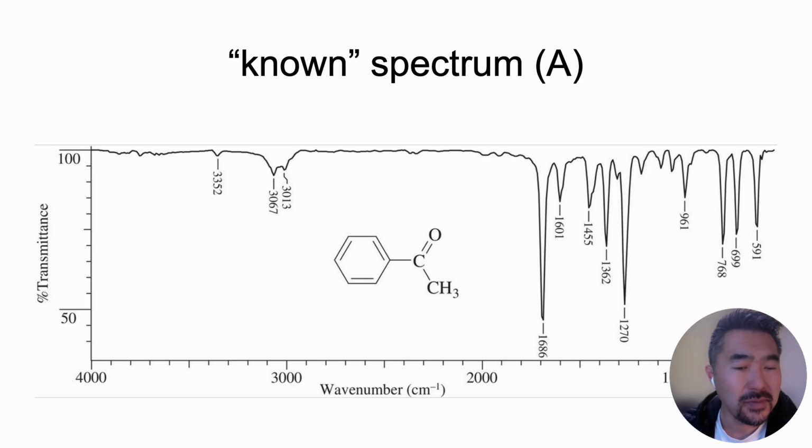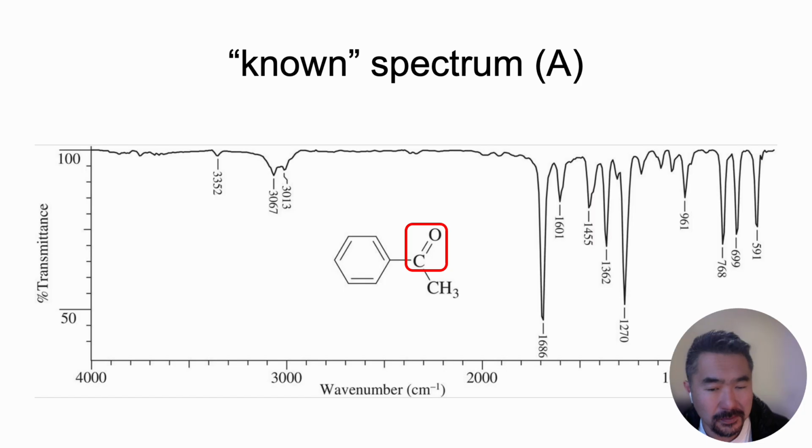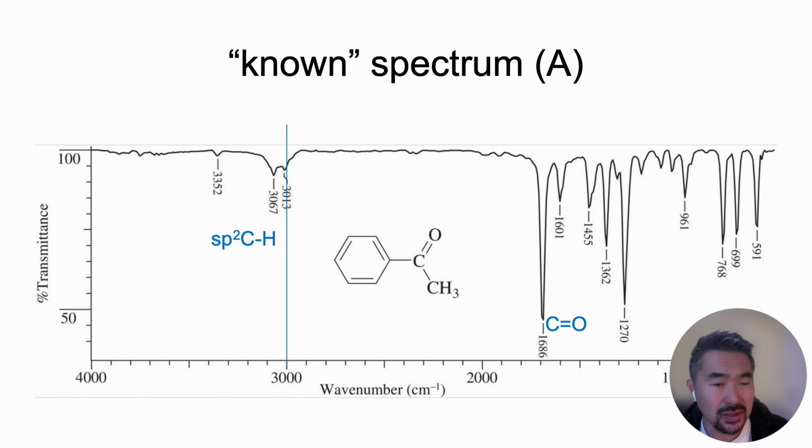Okay. Here's a compound actually known as acetophenone. It smells like a pistachio because this compound is actually present in pistachio. But here's the carbonyl, which shows up here again. It's lower than 1700 because of the conjugation. So we could identify that as carbonyl. And we should see sp2 alkene-type CH stretches, and then indeed we see that right after 3000, a little bit above 3000. So those are sp2 CH.